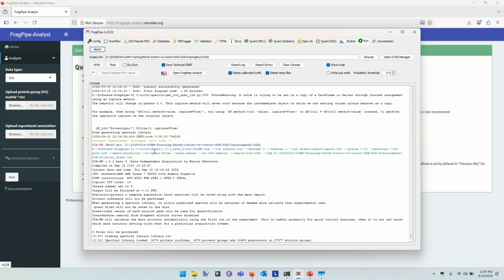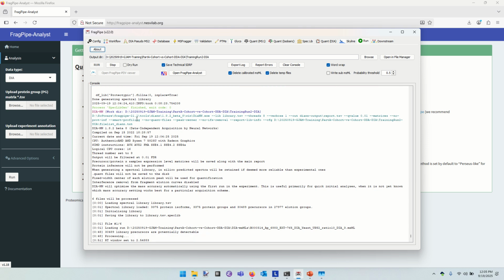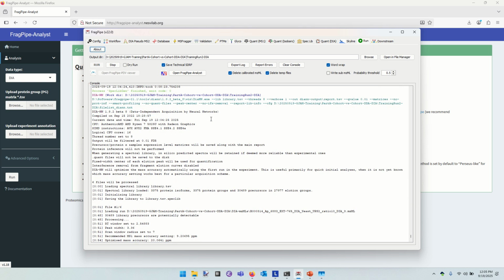Thank you for saying, Chris. I appreciate it. No worries. I was looking at your DIA-NN startup message there, whether it's using match between runs. Because it is not, but I don't think it's a problem, now that I think about it a little bit more. You can see there's no line that says match between runs was invoked. It wasn't. Interesting.